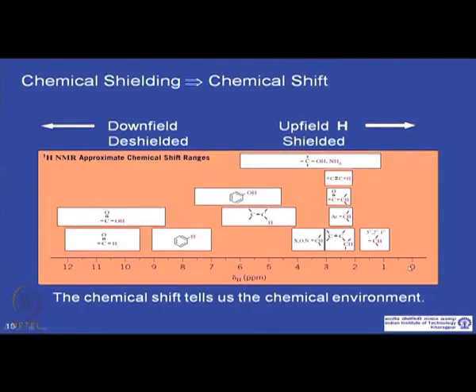So, if you compare in a standard different groups, like in case we are talking about the hydrogen atom, the proton. Now, these protons will have different chemical environments, so they will experience a different external magnetic field. So, their resonance energy will be different. Now, though the differences are very small, they can be resolved, and so they can be put on a scale.